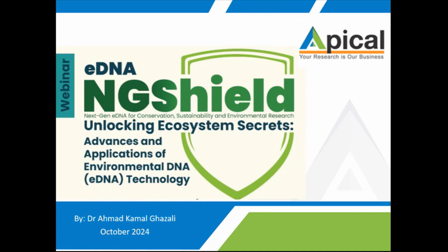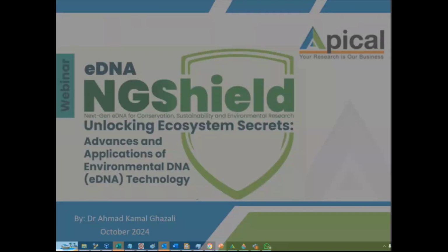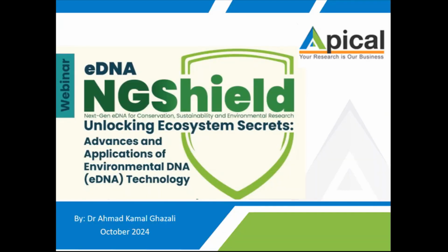All right. So today we are talking about the topic of environmental DNA, and how we use the NGS method to study environmental DNA. This is an advanced version of what we commonly know as 16S and ITS, right? So not limited to only 16S and ITS, we advance further to other genes of selection.